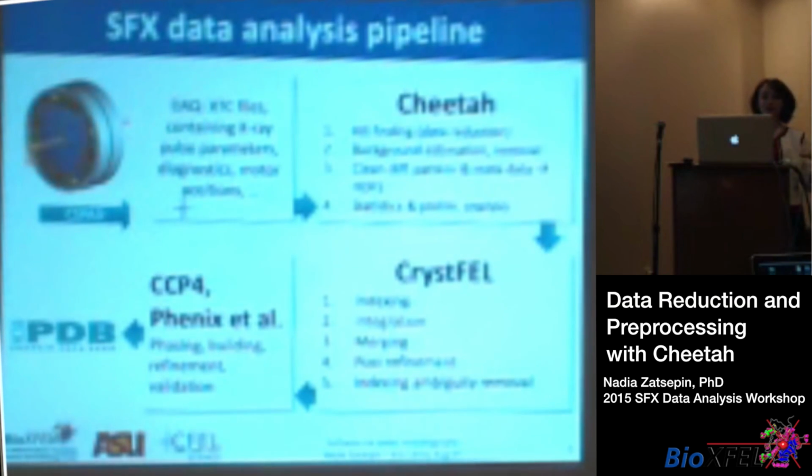Everything that is being recorded, your diffraction data and measurements from all the sensors that you wish to record, is dumped into one file, or a number of files, so that it can write out a lot of data simultaneously, but you only have to consider it as one file, and everything's there together, in this LCLS format called XTC format. So it's got all the metadata that you may want to know. You can even have a measurement of each X-ray pulse spectrum, per pulse. We want to have all this information.